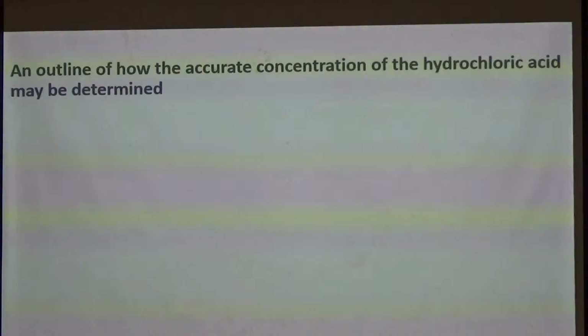Okay? Alright? Now, you have two different concentrations, one for NaOH, one for HCl. NaOH, you know for sure, is 1.00 mole per dm³. HCl is approximately 3 moles per dm³. Okay, do you think you need to do a dilution? Will anybody do a dilution? Maybe some of you may want to do a dilution.